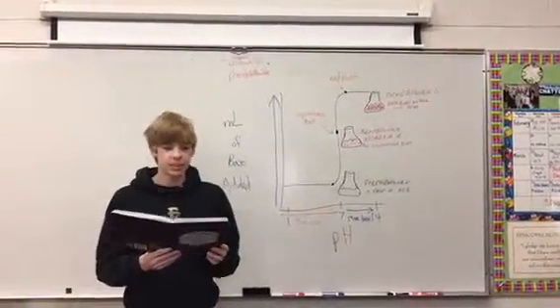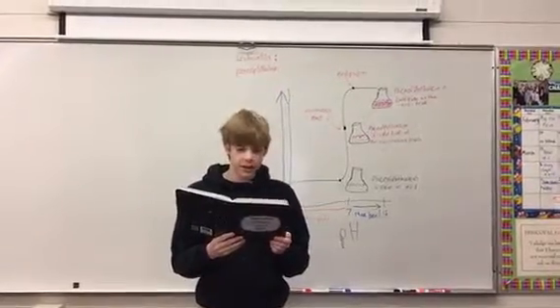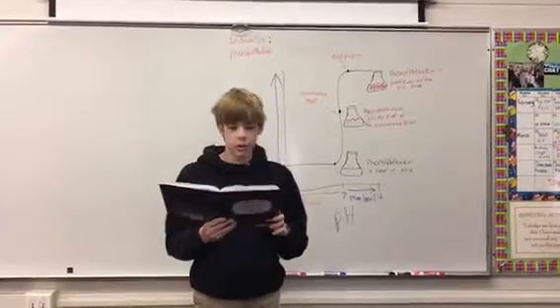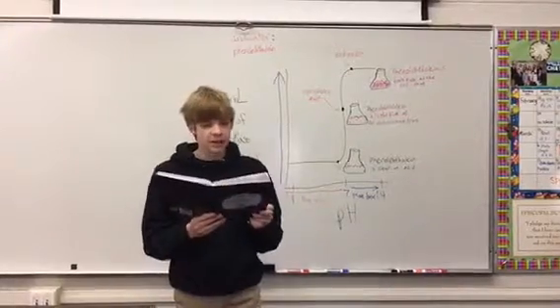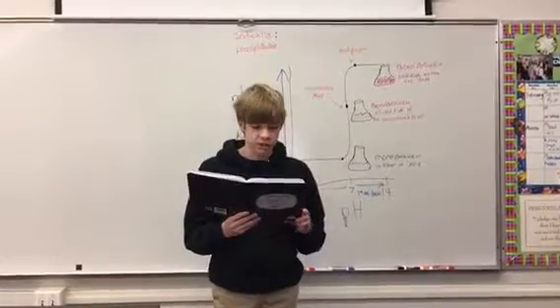The purpose of this experiment is to determine the unknown concentrations, the pH, and the pOH of 3 different acids by titration. Titration is the controlled addition and measurement of the amount of a solution of known concentration required to react completely with a measured amount of a solution of unknown concentration.